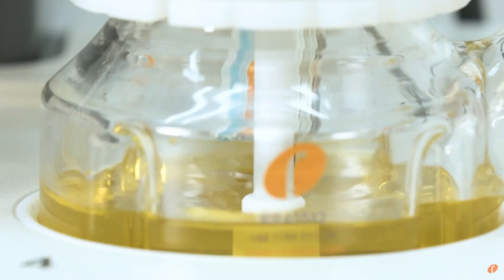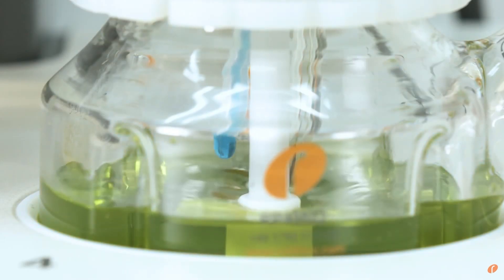With the Maya 4, we can skip that reformulation step and we've got fantastic scale-down data. We can go directly from a 100ml Maya flask into a 100-litre glass jacket and keep the formulation and processing parameters the same.